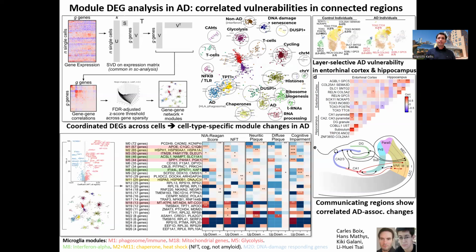So basically what single cell analysis allows you to do is say, what are the expression changes that are happening within every one of those buckets of different cell types? That's the first level. And that you can do with even pseudobulk analysis. You can take all of the cells, dissociate them, measure 10,000 cells per person, and then simply condense that into 7 measurements. As if you had sorted excitatory neurons, inhibitory neurons, astrocytes, microglia, vascular cells, and then you did a bulk experiment on each one of those. That's fine too, and that's the pseudobulk analysis that we're describing there. Make sense? Great. These are all fantastic questions, so keep them coming.